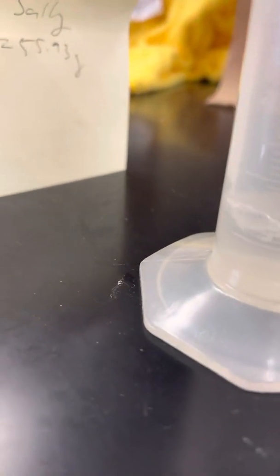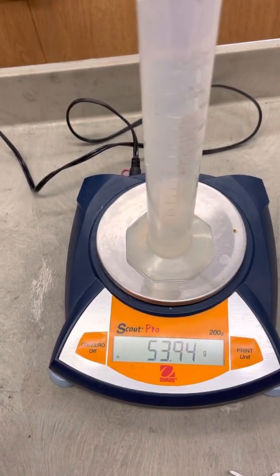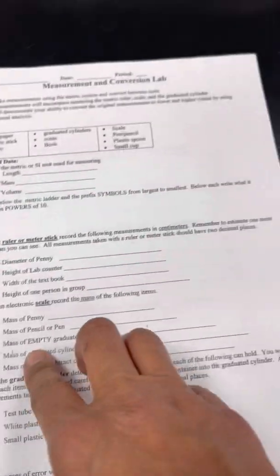So I'm going to measure out 10 milliliters of water. It's really down there at the bottom. A little bit less. Okay, so that is exactly 10 milliliters. Not very much, so we'll see the difference. That's our new mass after 10 milliliters of water. Okay, so that's all the data for parts 3 and 4.